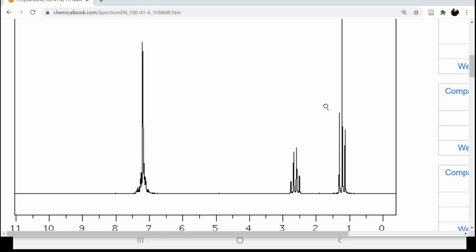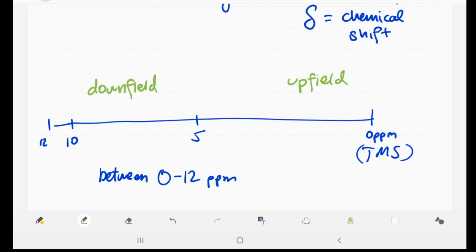It used to be done kind of manually, where you'd scan these different frequencies one by one, which was terribly tedious. Now it's all done at once. You scan all the frequencies at once, and you do a Fourier transform and do all this lovely math, and poof, you get your spectrum. But these terms still show up. That's why we still have these terms.